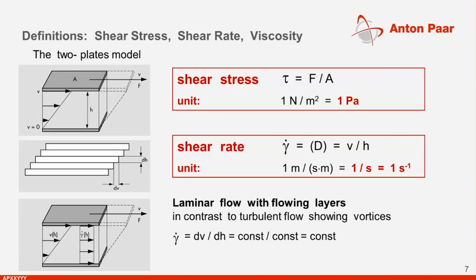So this is a rotational test, and for good rheological values, we must be sure that we are having constant flow between the different layers and also between our two plates. If, for example, the gap is too high, we cannot be sure that the whole material within the gap is sheared. Furthermore, we could have the problem that the material starts to flow out of the gap, which would lead to lower values than we expect. This is especially a problem if you are measuring at higher temperatures, where our material becomes more liquid.